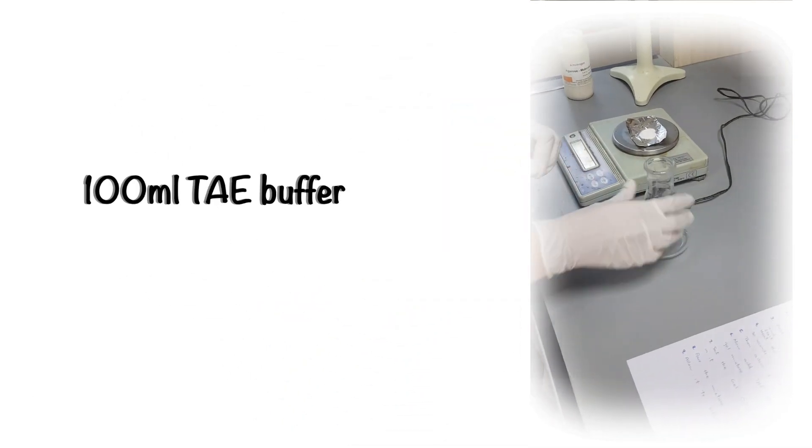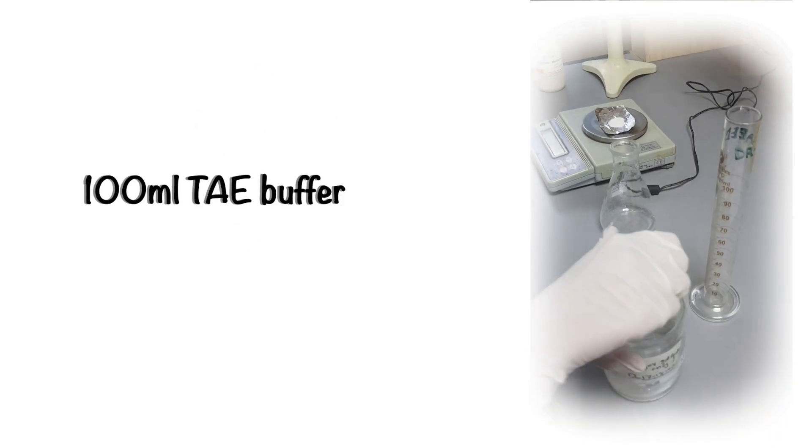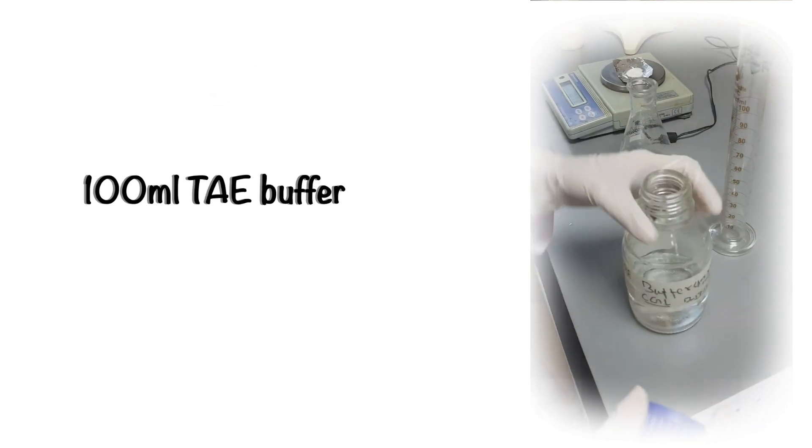Now take the 1x solution of TAE buffer — we will shortly make a video on its preparation also. Measure 100 ml of TAE buffer in a measuring cylinder and pour the buffer in a flask, then add agarose powder in it.